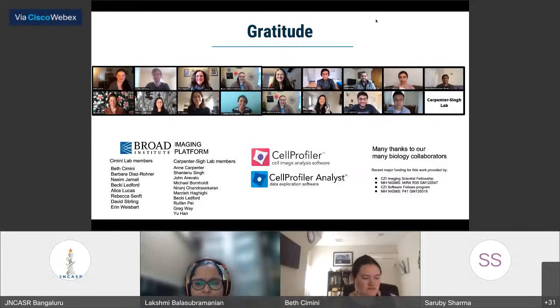Okay. So all of that is laid out in the Nature Methods article that I mentioned.